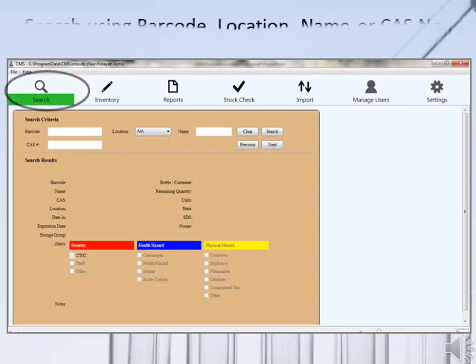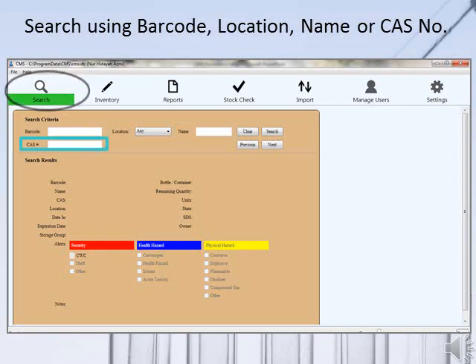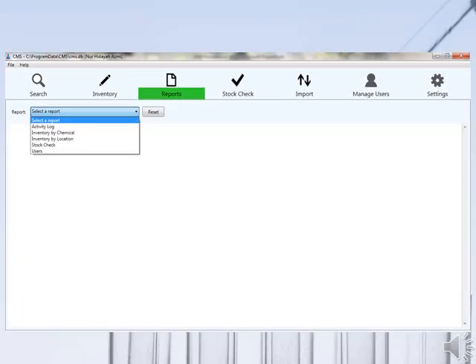The Search tab allows all users to find specific information on a chemical based on its barcode, chemical name, CAS number, or location. This method of search is more effective and can save time.